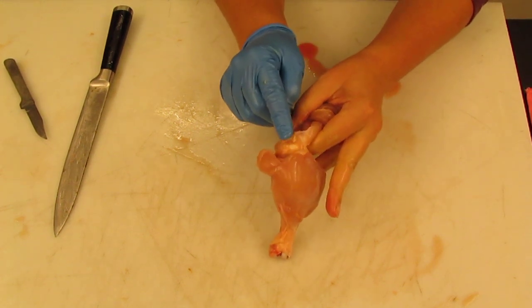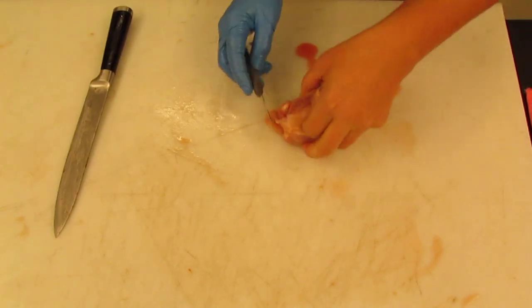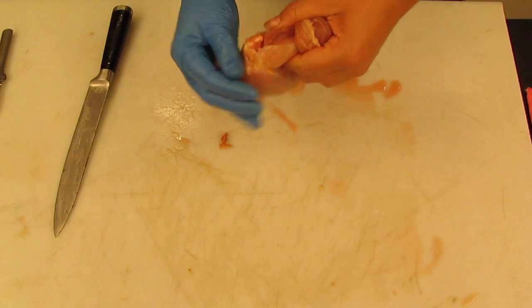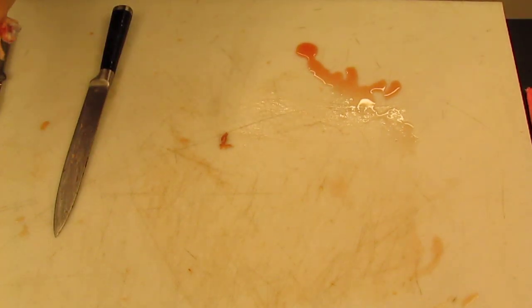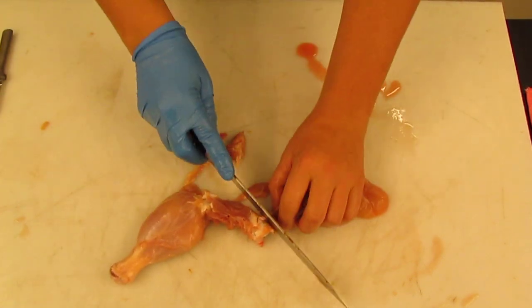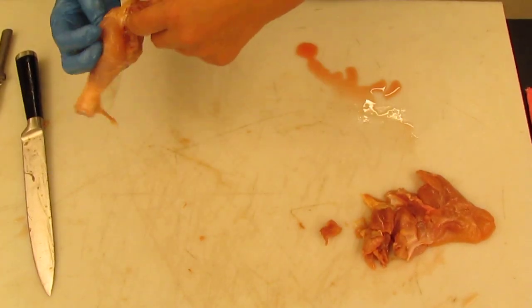Right, a little bit pathetic, more pathetic than we would think in a human body, but they don't really kneel to play in the garden or anything, right? They don't really need huge kneecaps. Cut some of this muscle away a little bit more. Right, and now we can see, especially if we bend the leg, this is part of the femur, or the thigh bone, and this here is the patella. I'm going to get rid of the rest of this thigh muscle so that we can see the knee. Okay. Don't have to be terribly precise here.